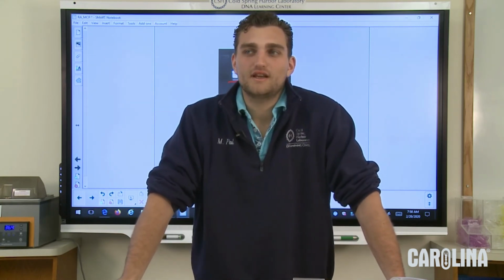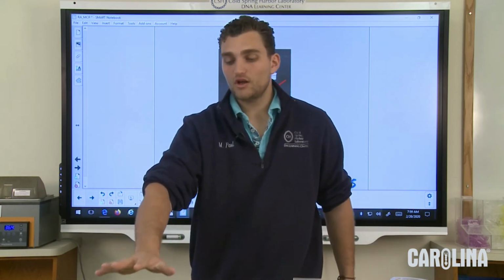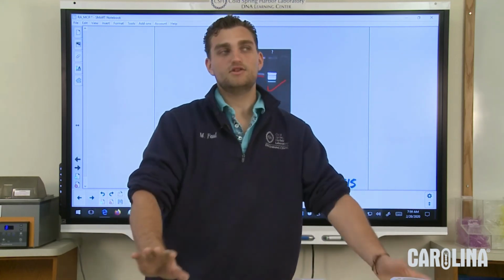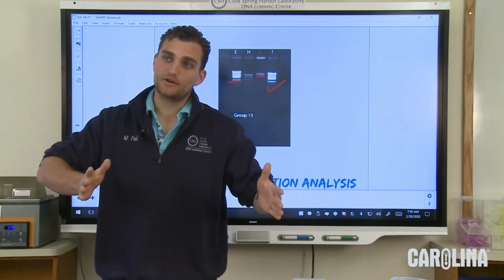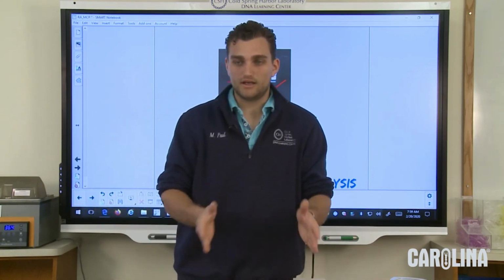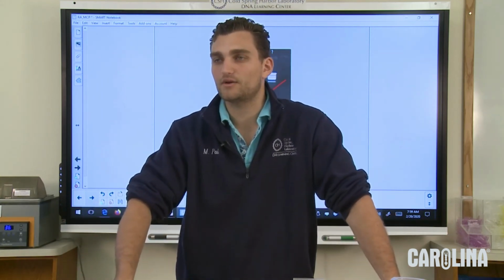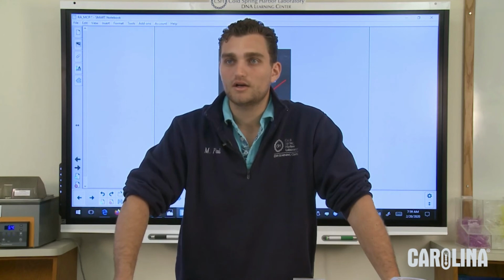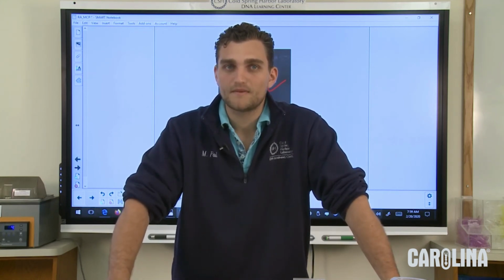All right, so we're just taking a little time to answer that first one. How long are we going to run the gel for? So we run the gel for 30 minutes currently, and that's just going to help separation. If I want to run it for longer, I can. It'll separate things out a little bit more. So I can run it for longer if I want to get more separation, or I can run it shorter if I don't care that much about that.